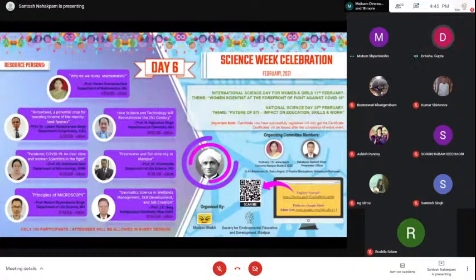Very beautiful and very detailed, and the students are really grateful to you. We are all grateful to you for pointing out so many details, because generally we know the compound microscope and we are using it, but we don't know the many details which you have pointed out very beautifully of the objective lens, ocular lens, and condenser lens, their types and functioning, and how to correct.